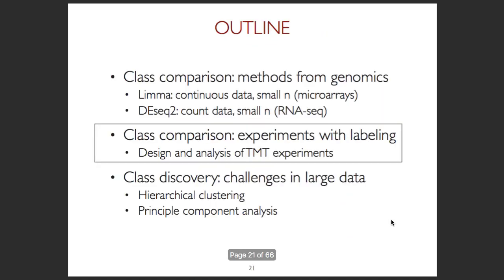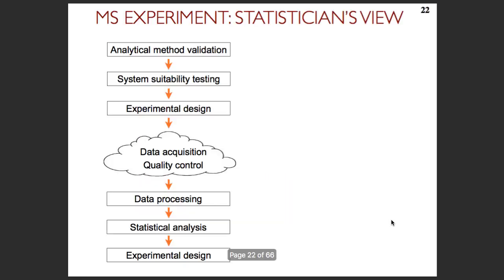All right, TMT, finally. I may have mentioned previously, this is the first time we present our work on TMT. This is a beta version of MSstats for TMT. Ting, who is here, can you wave, is the author of that, and she will be leading the hands-on part. What I would like to do is to illustrate a little bit the philosophy behind TMT and why it is different from the rest of MSstats, and why we could not incorporate this in MSstats directly. And then after the break, Ting will actually give some examples with hands-on part.